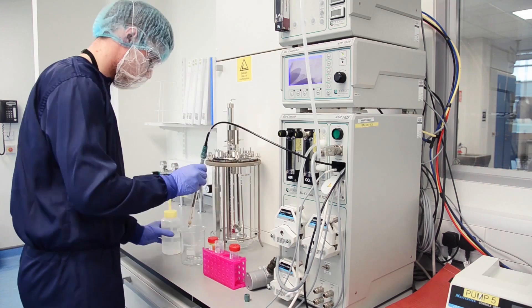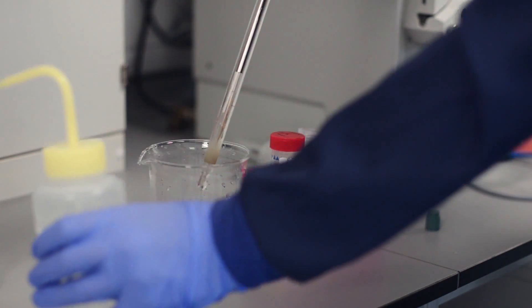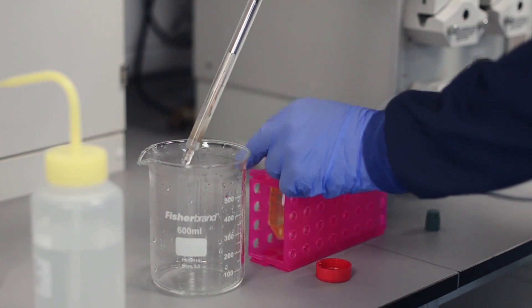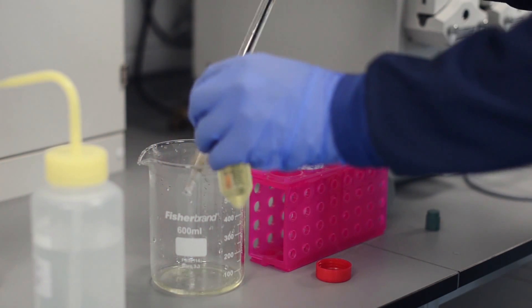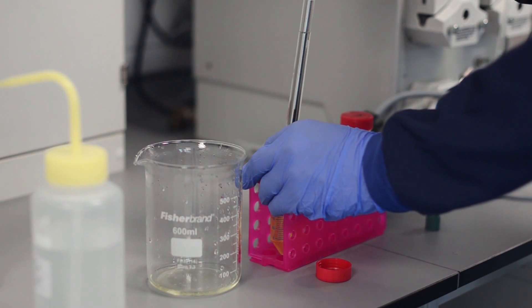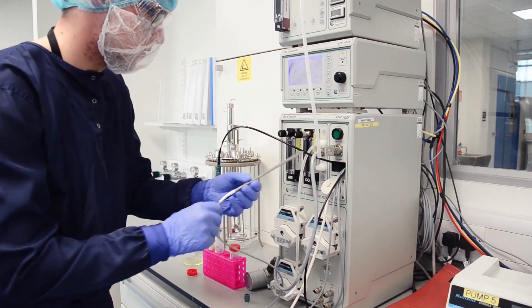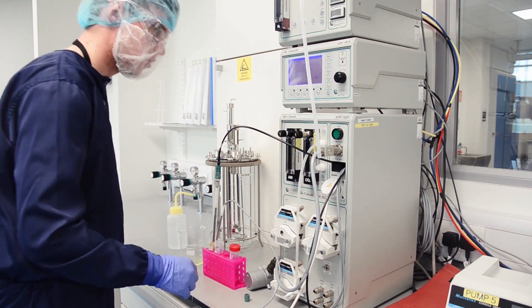The probe is first rinsed with ionized water to ensure residue is removed. It is then rinsed with pH buffer 7 and inserted into the buffer along with the temperature probe, as pH varies with temperature. The controller is then told the pH of the solution it is reading.